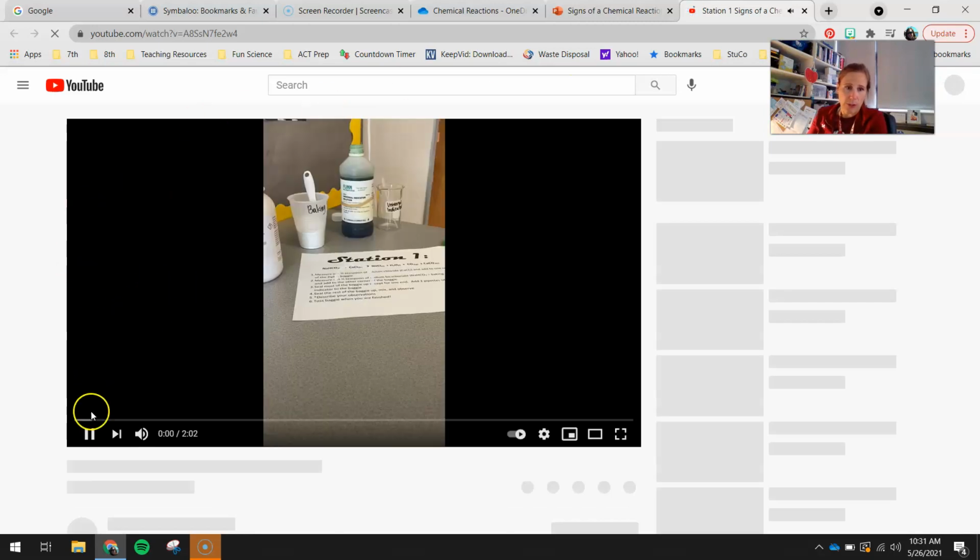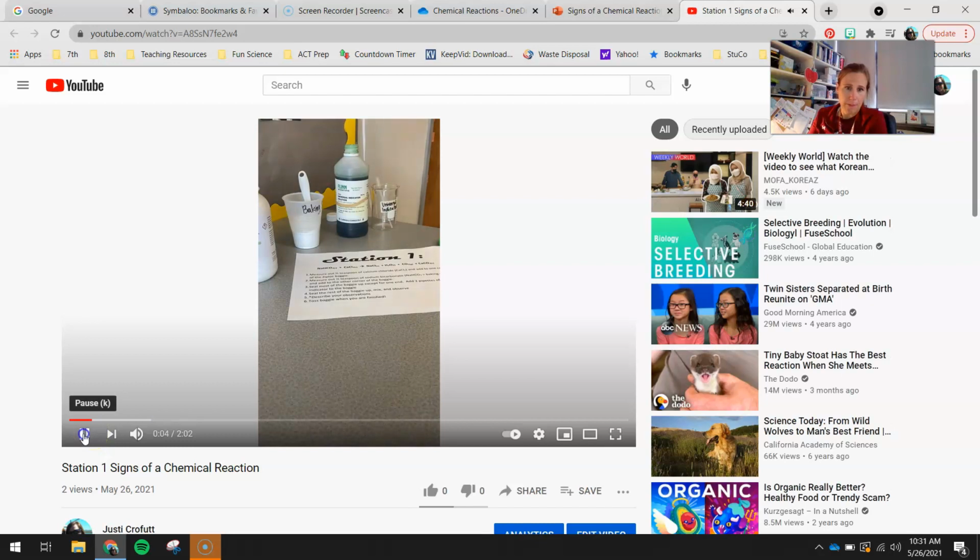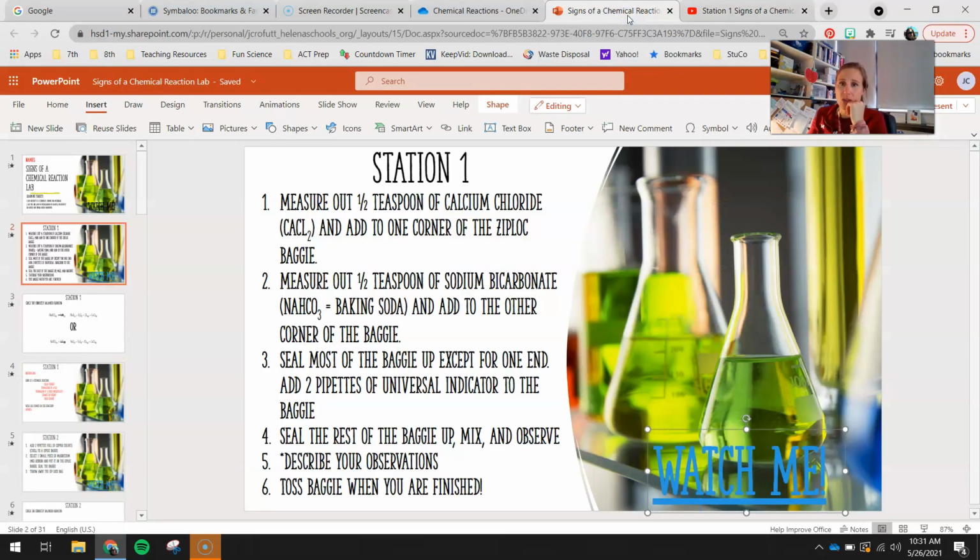So this is the first one for station 1. Station 1, and this reaction should look fairly familiar. Okay, so that's what station 1's video looks like. You guys will obviously need to watch that in its entirety to get all of the observations out of the way. For each and every one of these 10 stations, you guys will need to write down your observations.